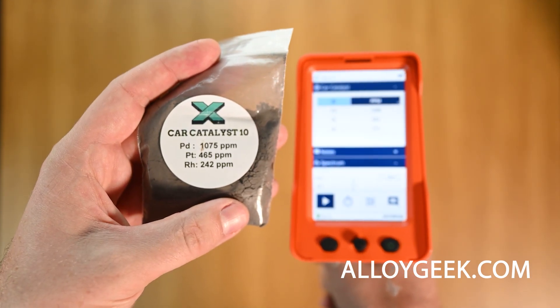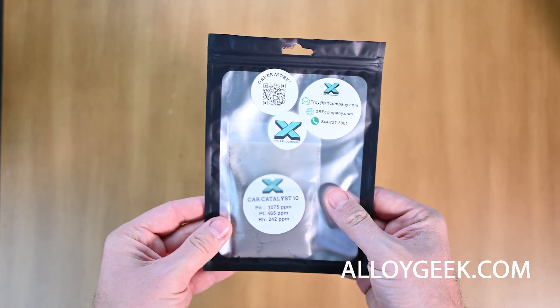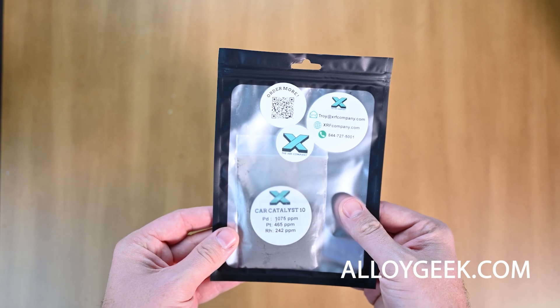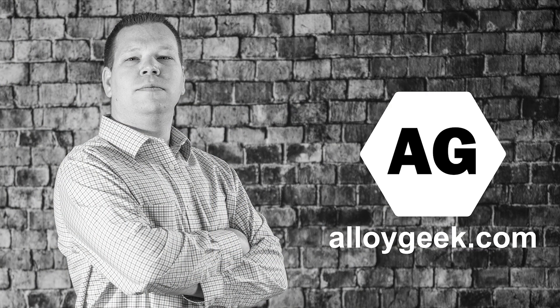The sample cup with thin film is the best practice. Ally Geek can consult with you to come on site and teach you how to test your catalytic converter materials. We can also equip you with the right handheld XRF and the right reference materials. Reach out today at allygeek.com.